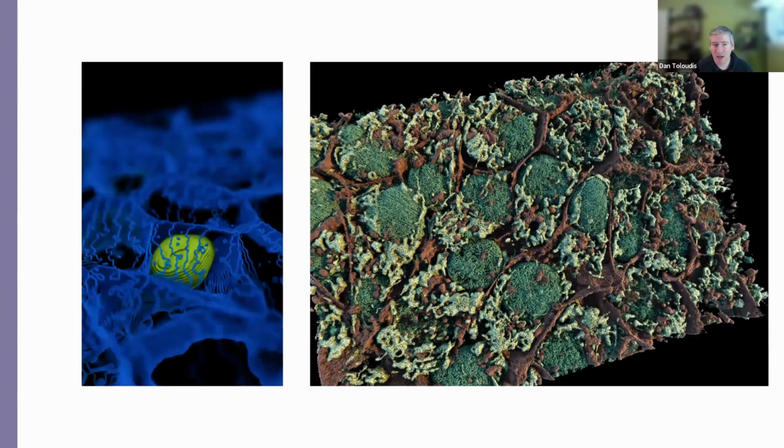Different types of volumetric data. This one on the left is showing an aspect of the physically based camera model. So you can actually do depth of field blurring in the foreground and background and choose a focus point in the midground if you want to. You can move that focus forward and backward if you like. And these are also showing some of the lighting and shadowing aspects from the physically based lighting model. So it really makes it easy to pop out 3D features in your data.